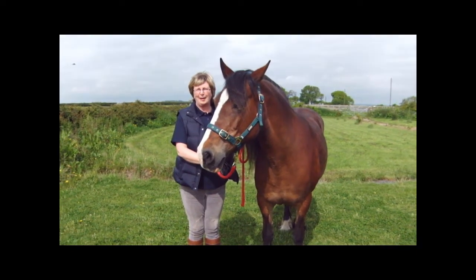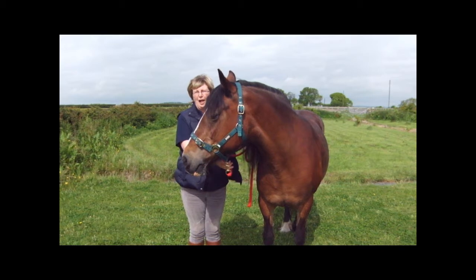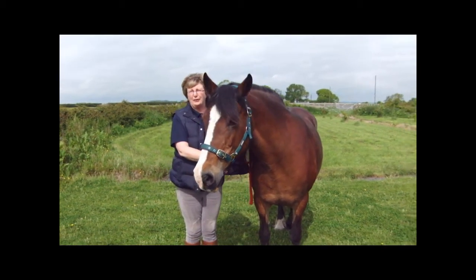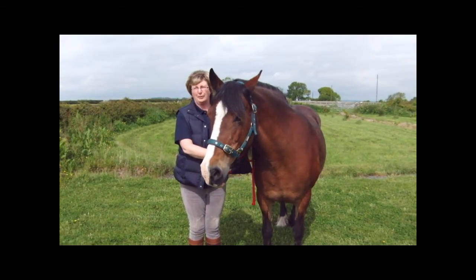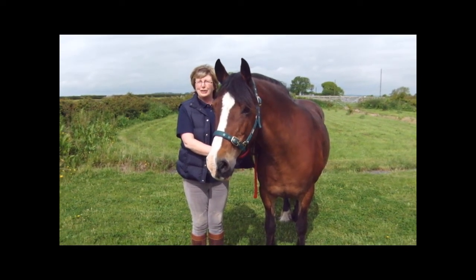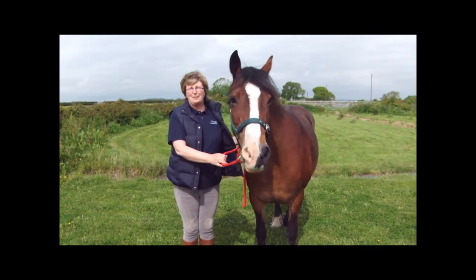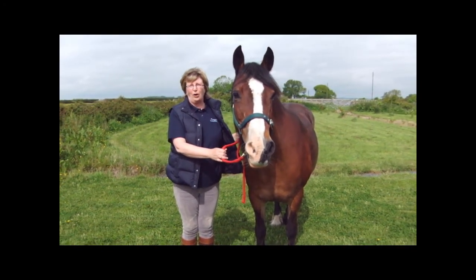Hi, I'm Jill Booth from Westgate Labs and our mission remains, as always, to help horse owners to improve their knowledge and practice of horse worming. Today I'm here with my horse Lady and we're going to show you how to take the sample for the test. It's important to get that bit right so you get a good test for your horse.